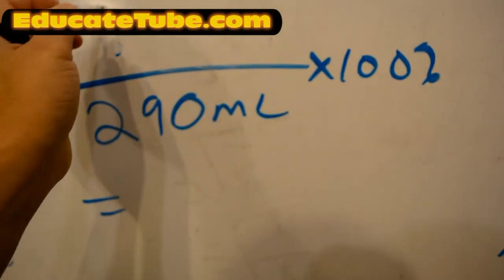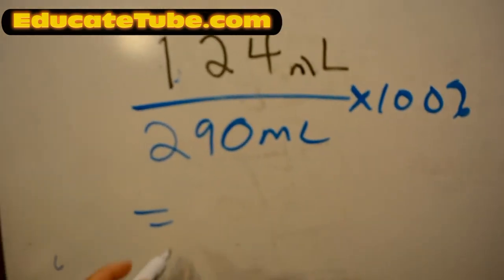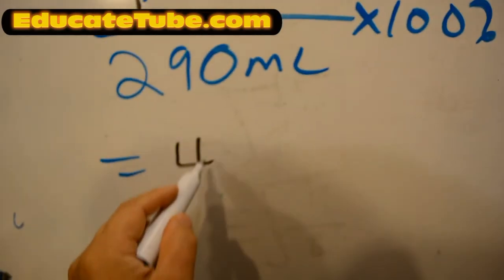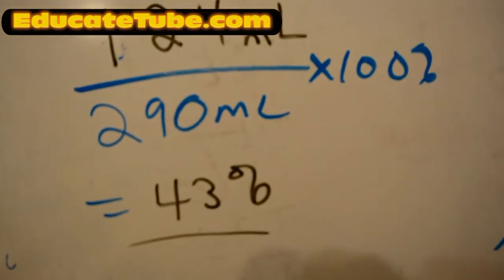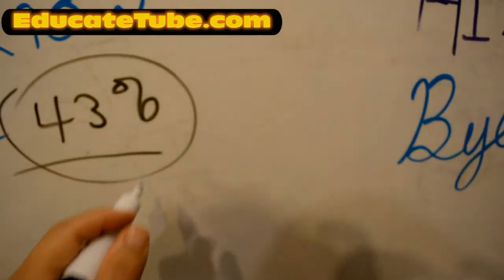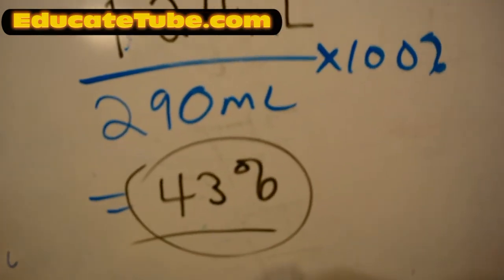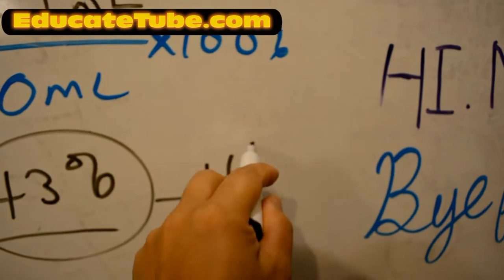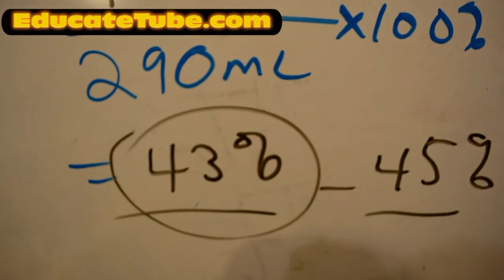Okay, so we had 124 milliliter, and that'll give me about times 100%. That'll give me about 43% yield. So I did 4 trials, and the two numbers that keep coming up are consistent, even after I make sure there's no leak. I'm sure there's some leakage, but even then, we're talking about between 43 to 45% yield. Not very good, but got to figure out why that's the case.